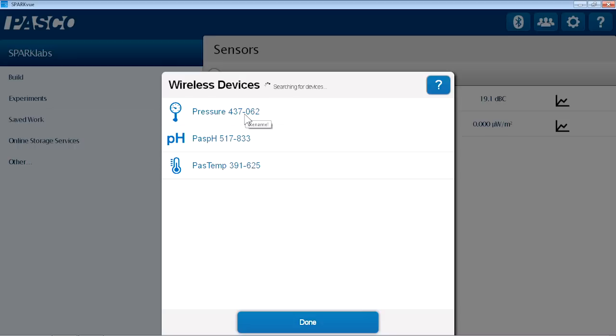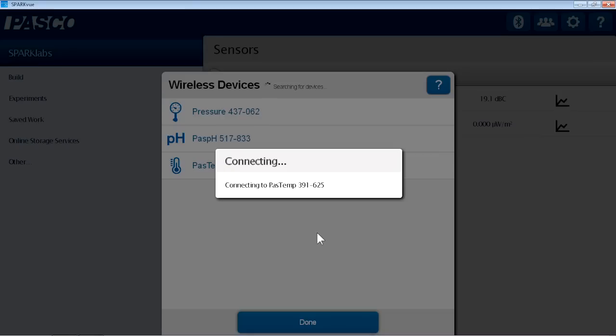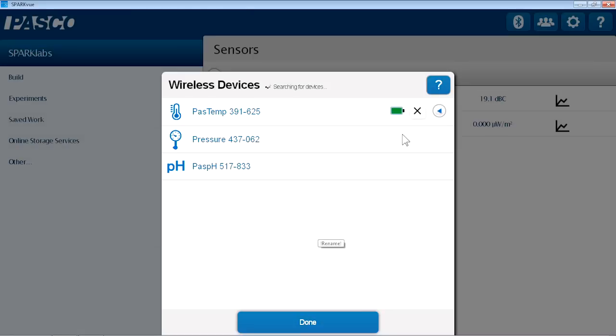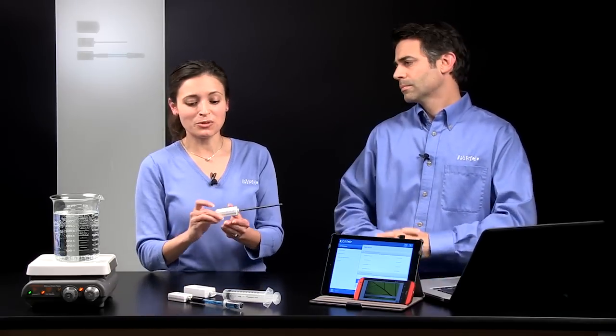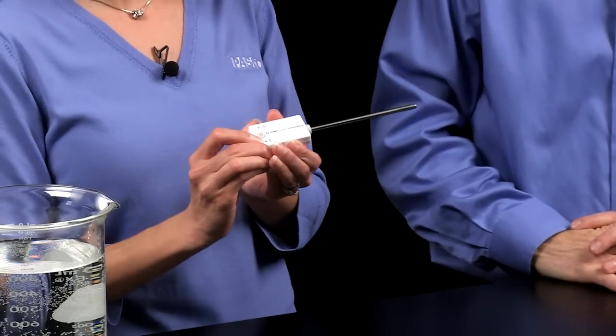And if I have a class set of a particular measurement, I can identify them based on their unique ID number. So I'm just going to touch the temperature sensor. It's going to connect to that sensor. I can see that it's connected. I'll hit Done. And I can see on the sensor that the Bluetooth light is now flashing green, indicating that it's connected.